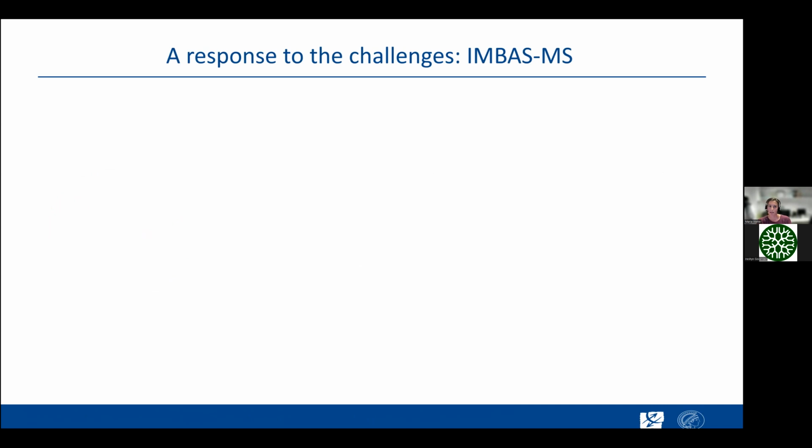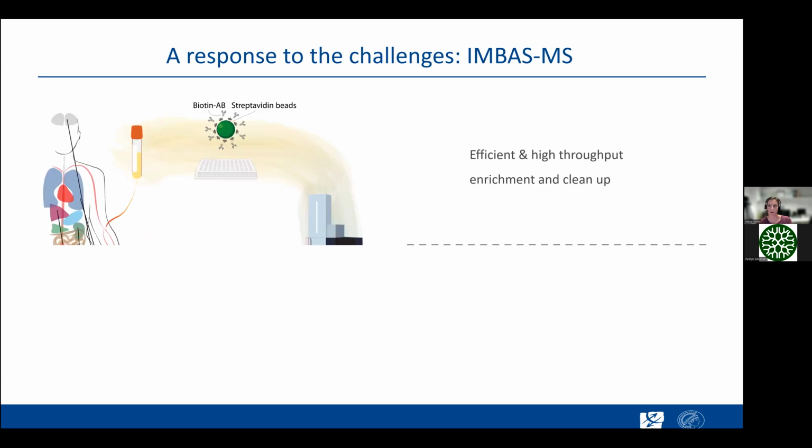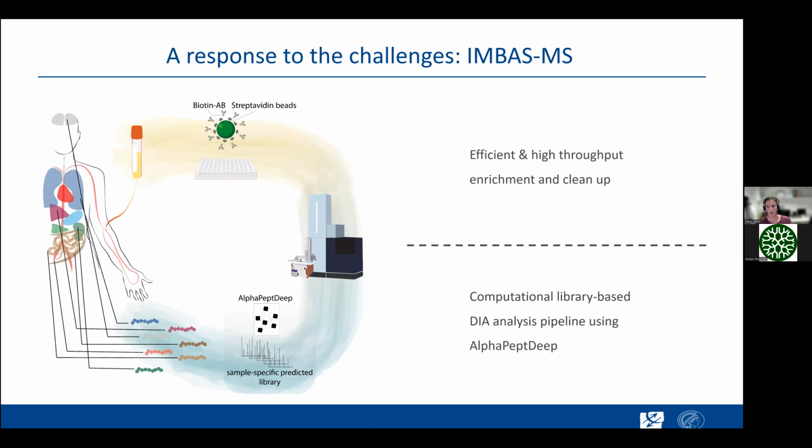So what I designed in the first part of my PhD here was the IMBAS-MS workflow. This is a workflow tailored for efficient and high throughput enrichment and cleanup of HLA peptide protein complexes from body fluids, in combination with a computational library-based DIA analysis pipeline, and later on interpretation of those peptides. And we called it IMBAS because it stands for immunopeptidomics by biotinylated antibodies and streptavidin.